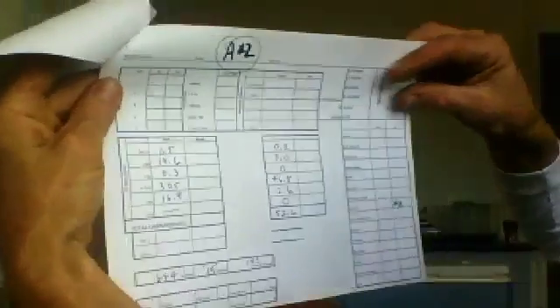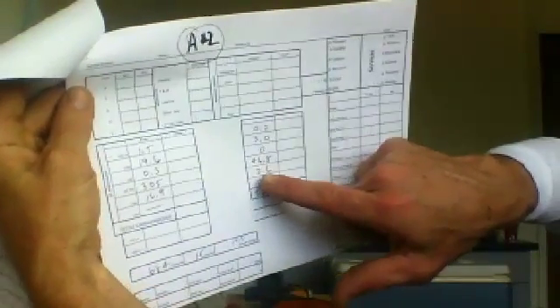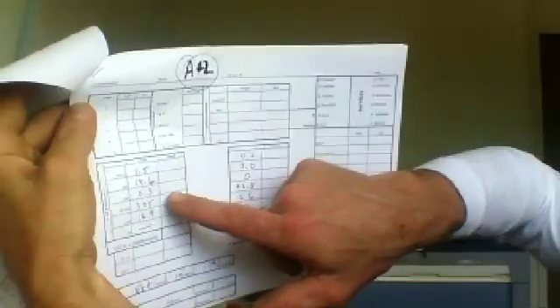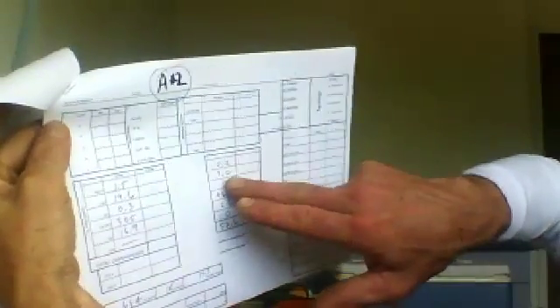The second one we said was the RSO or the infusion, and we have it there. I hope you can see it all. There we go. We have 52.6 in the total value. CBG is a nice one. Look at this, 2.6. Then what do we have here? Delta 9 THC, we've got 46.8. We have CBD at 3%.